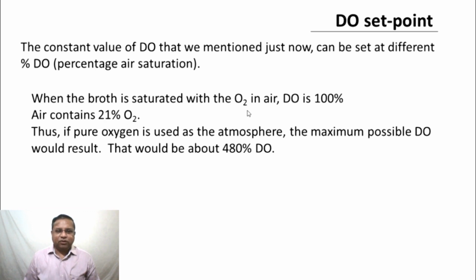When the broth is saturated with oxygen and air, DO is 100%. Air contains 21% oxygen. Thus, if pure oxygen is used as the atmosphere, the maximum possible DO would result. That would be about 480%.